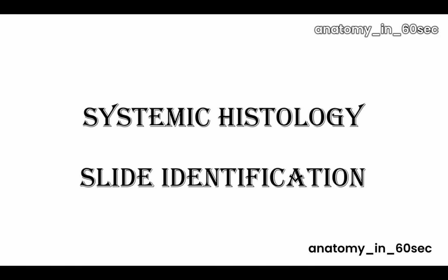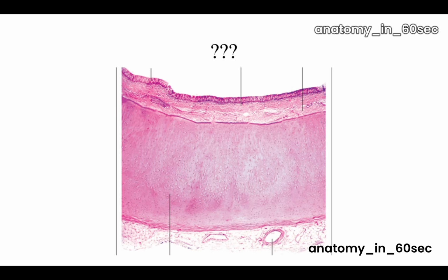Hello all. இன்னைக்கு systemic histology ஓட slide identification points தான் பார்க்க போறோம். Slide number 1. Try to identify the slide.